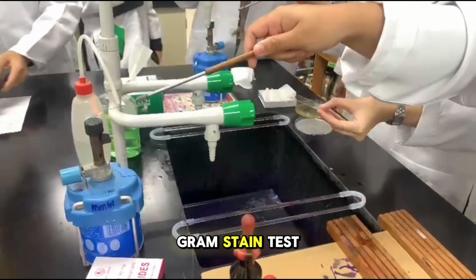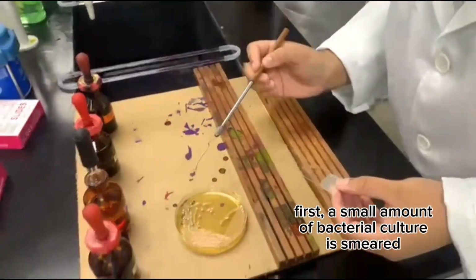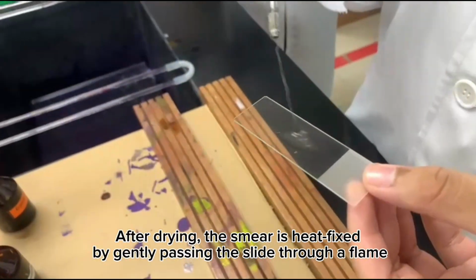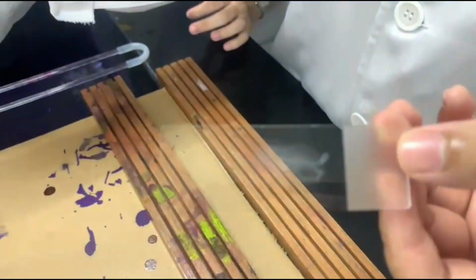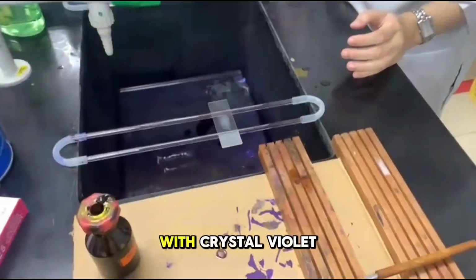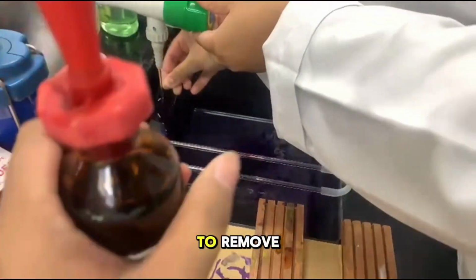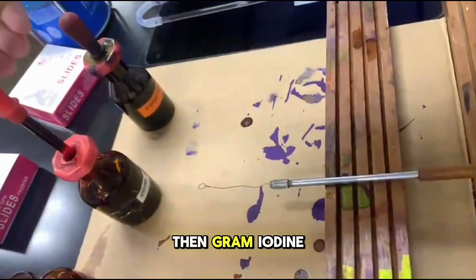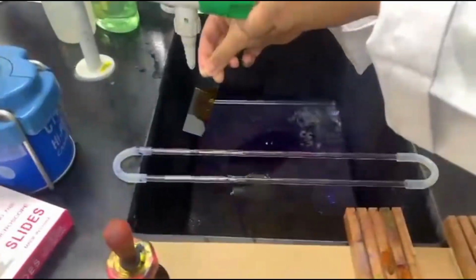The first test was the Gram stain test to determine the Gram reaction and cell morphology of the bacteria. First, a small amount of bacterial culture is smeared onto a clean glass slide and allowed to air dry. After drying, the smear is heat fixed by gently passing the slide through a flame. Next, the slide is flooded with crystal violet stain for about 1 minute. After that, the slide is rinsed gently with water to remove excess stain. Then Gram iodine is added for 1 minute. The slide is then washed again with water.